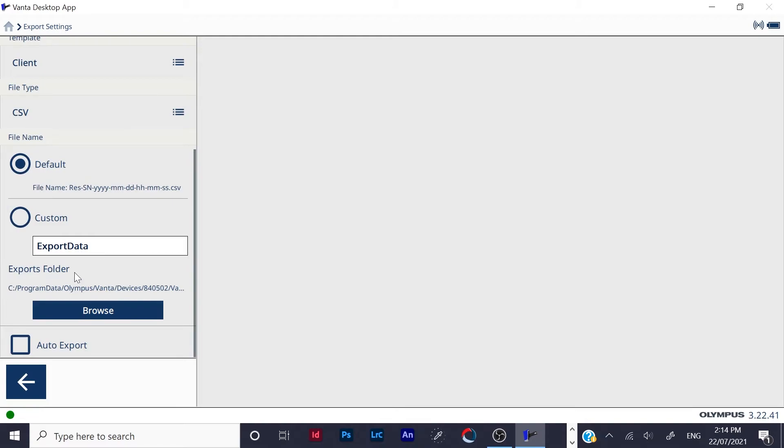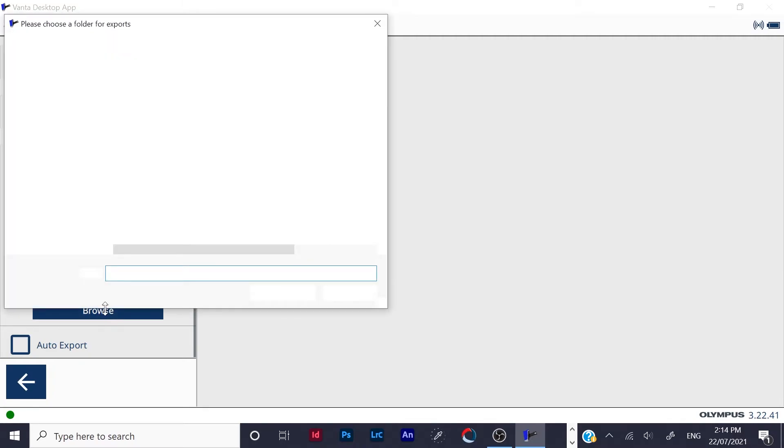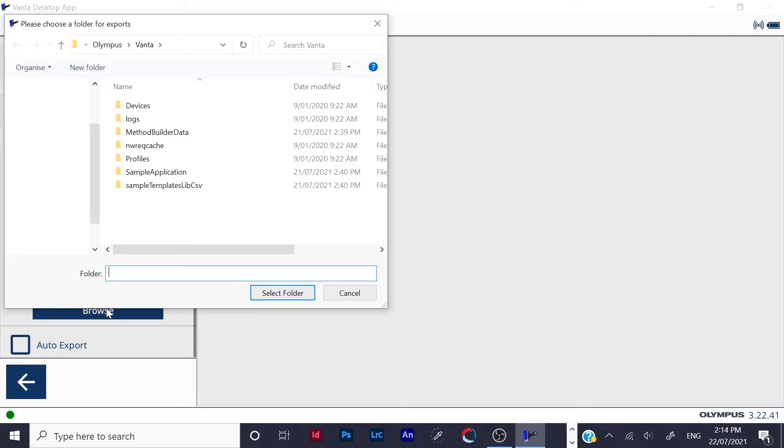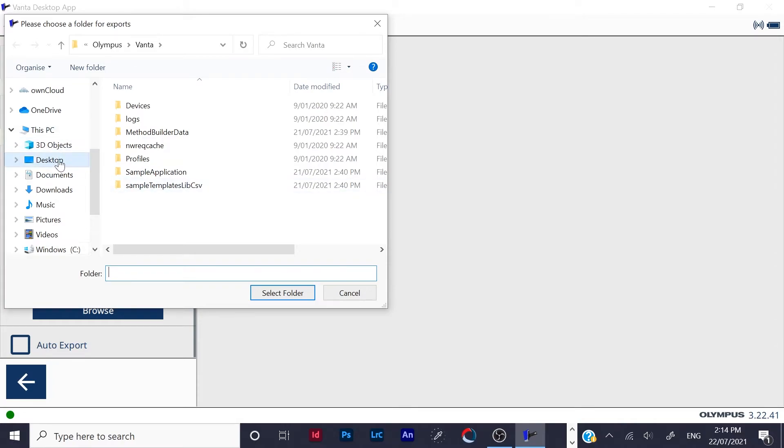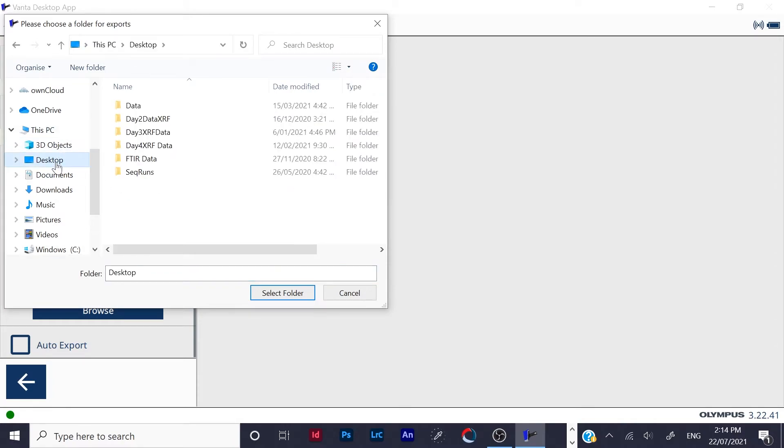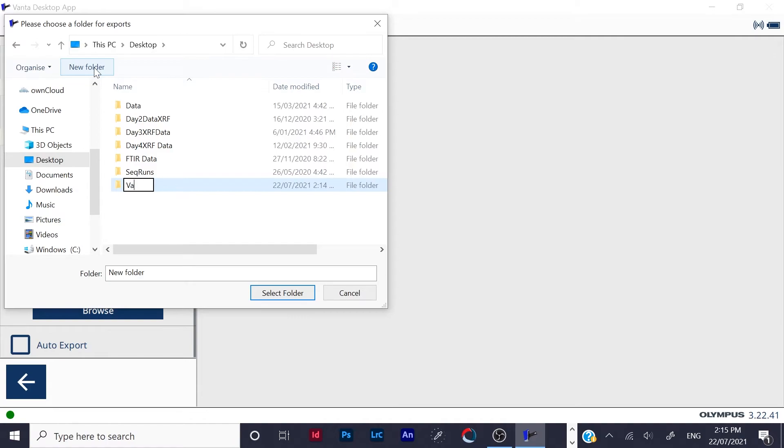Now you want to choose a place where you want your data to go on your PC. So you can click on browse, and you can make a folder on your desktop. I'm just going new folder, call it Vanta.